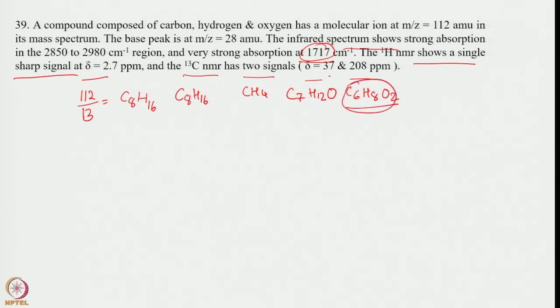So now with this one, let us identify. Let us assume this is the correct molecular formula. Now let us look into the hydrogen deficiency index. So 6 are there, 6 plus 1 minus 4, so 3 are there. So 3 means basically a ring plus 2 double bonds, 1 ring and 2 double bonds are there. This indicates the ring may not have inside double bonds. And we are seeing a signal around 2.7, which doesn't fit an aromatic hydrogen 1H NMR signal. So that means possibly it is not an aromatic ring. Let us try to write something like this, CH2, and if we write like this, 8 hydrogens are satisfied and 6 carbons are there, and then O2. Now this one is symmetric and shows only one sharp signal at 2.7.